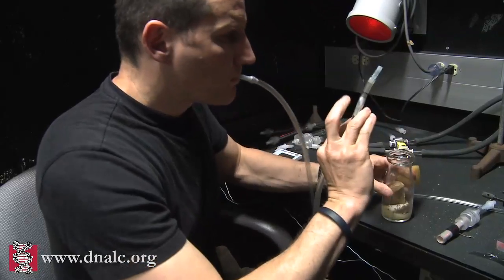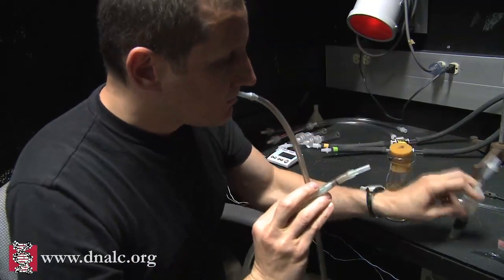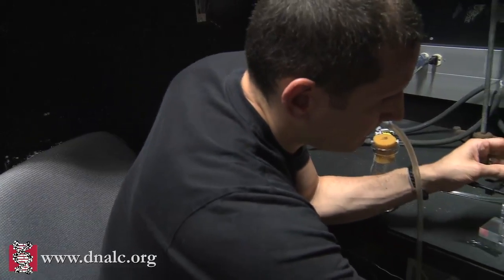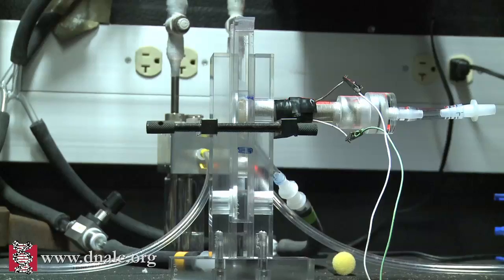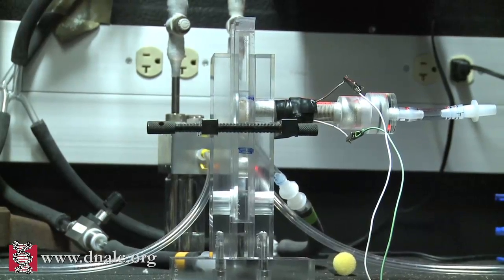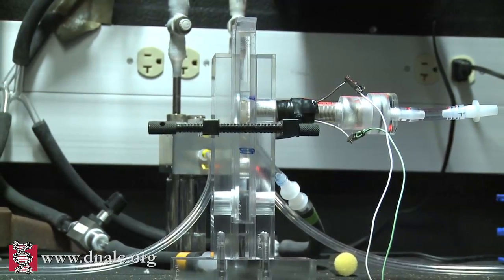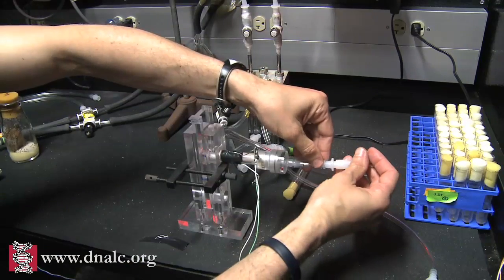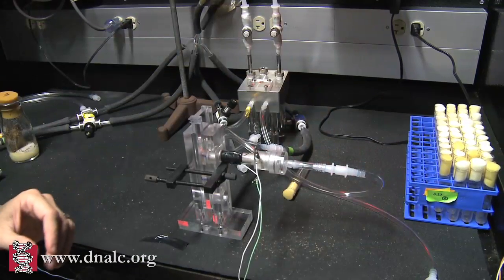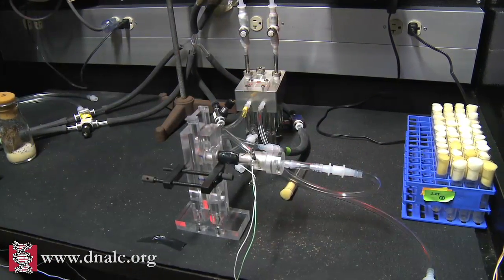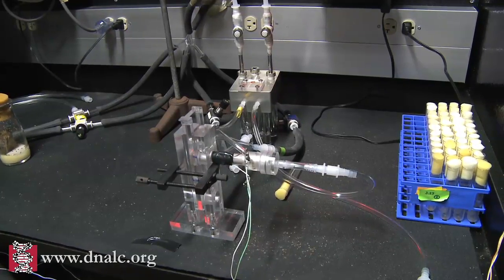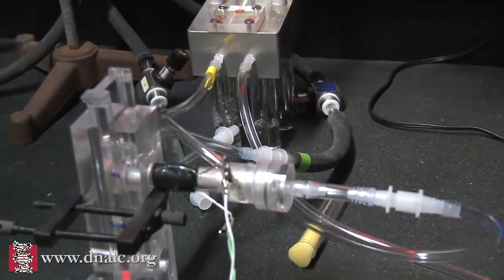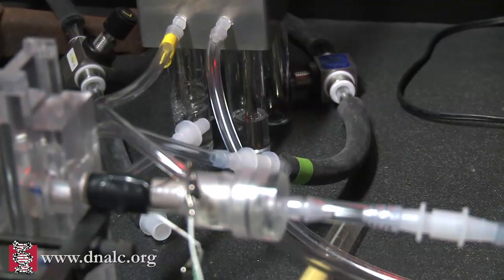The flies are loaded first into the training tube. The training tube has wires connected to it, and we can deliver electric shock and deliver odors on an air current through the training tube. When we connect the odors, the flies smell the odor on an air current. You'll see the bubbles bubbling through the mineral oil in the machine in the back that we call the bubbler, and that's delivering the OCT to the training chamber.